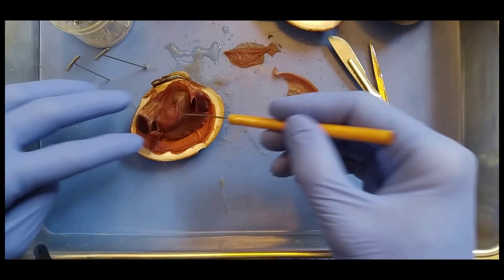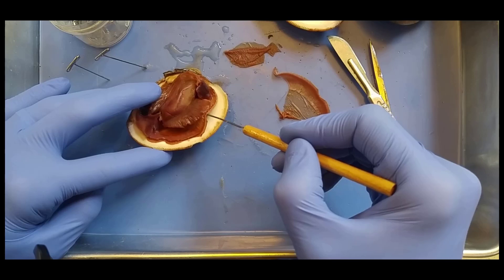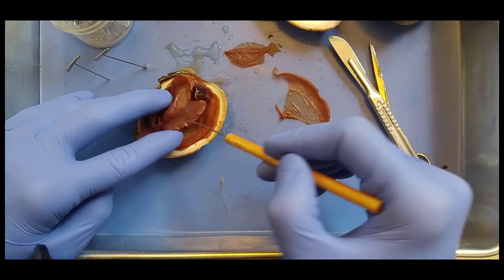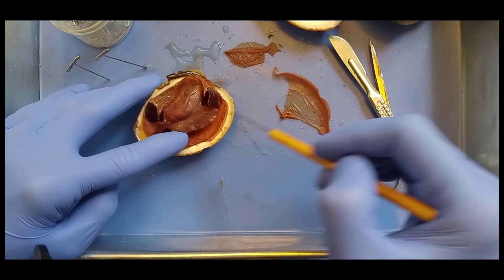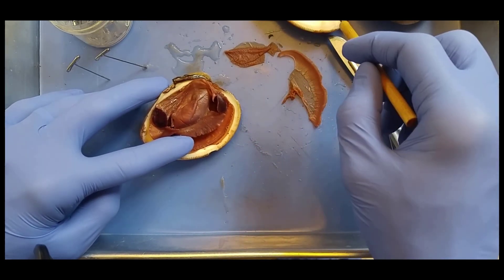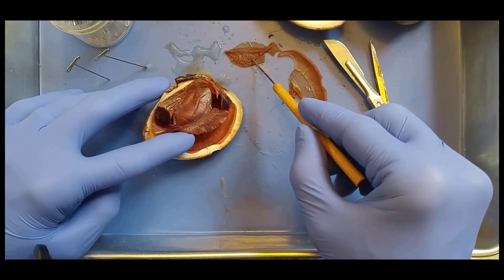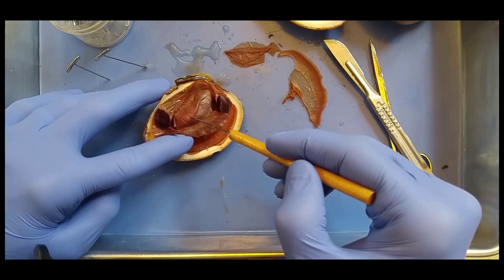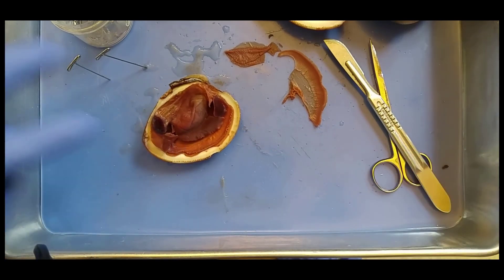So we have the visceral mass in here, and then the foot right here. The foot is what they're going to extend out to anchor themselves into the soil. And so this is a highly muscular, extensible, retractable foot for anchoring. So again: mantle secretes the shell, shell protects the organism, gills filter water for nutrients and gases, visceral mass contains the organs, foot anchors the clam to the soil.